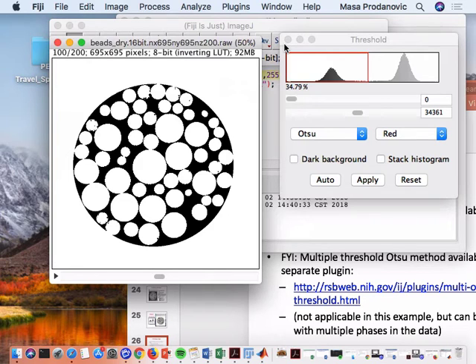What tool is helpful? I have a histogram. See how many black or white, depending on what you did with the background. 30%? 30% sounds about right.